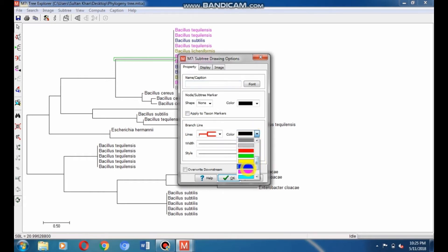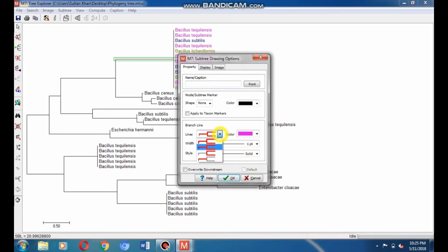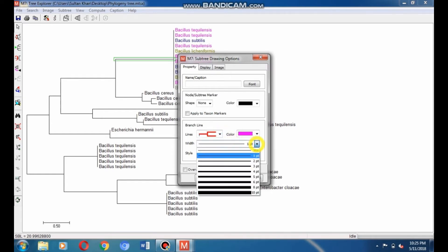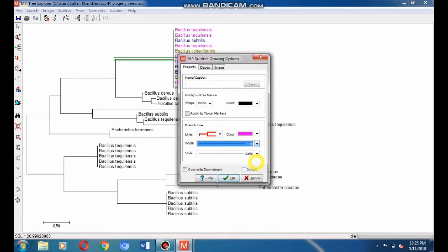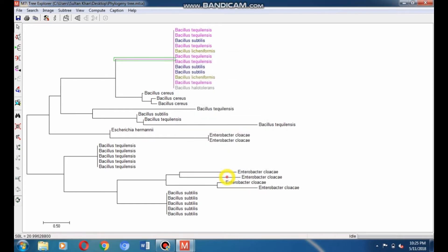You can change the branch line style and font width. Click on Style and select your desired style — either dotted or dashed line style. You can also nudge the width. Select your desired width and click OK to apply all the changes. Here you can see the colorful branch of the clade.